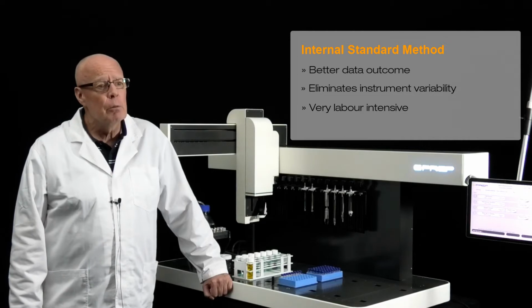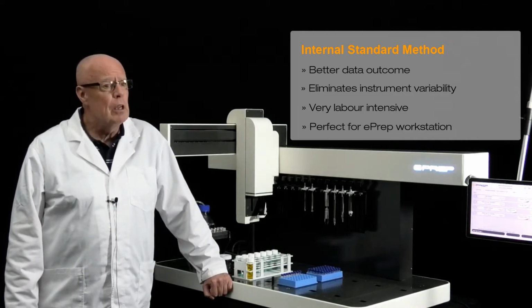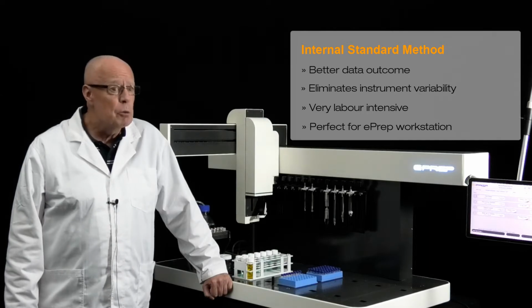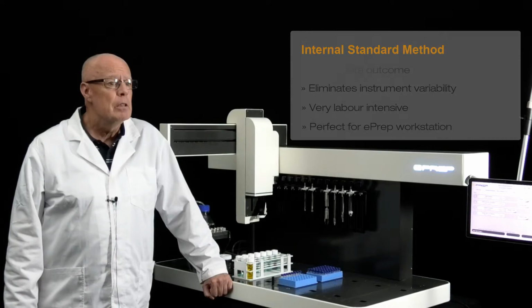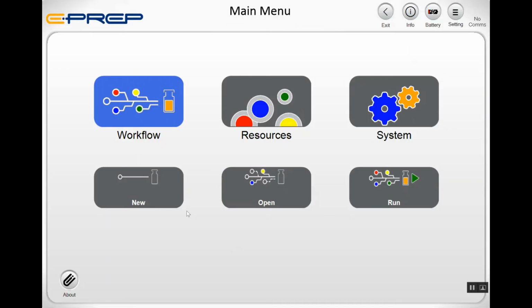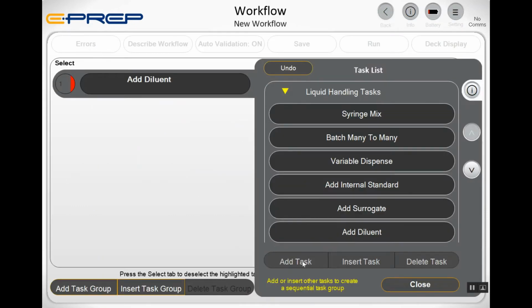So in this demo, I'm going to show you how you can set up an internal standard workflow through the ePrep tablet software. Then we'll see the ePrep in action executing this workflow. So let's get started. We will start by creating a new workflow by selecting New. And in this workflow, the first thing to do is we will add a diluent to each of the vials.